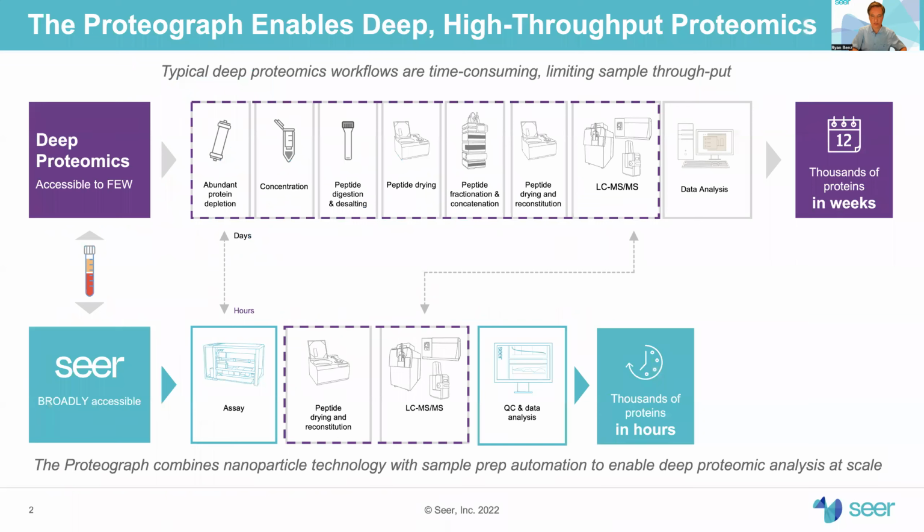As you may know, deep proteomic experiments can be challenging, particularly for complex sample types such as human plasma. While deep proteomics workflows exist, there are typically several challenges associated with them. For example, there can be many steps in the workflows that are complex and time-consuming to execute. Furthermore, these workflows usually require significant domain expertise, making them less accessible to the general scientific community.